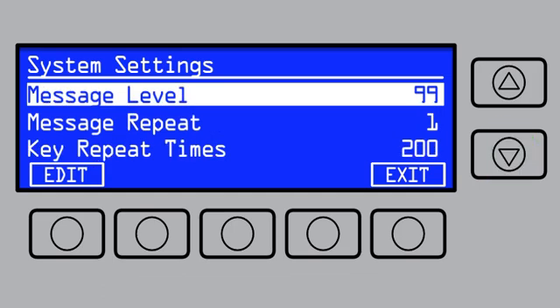Message level determines whether a higher-level message will appear on the display. Message levels 1 through 99 are for error and warning, and 100 through 255 are for general information.